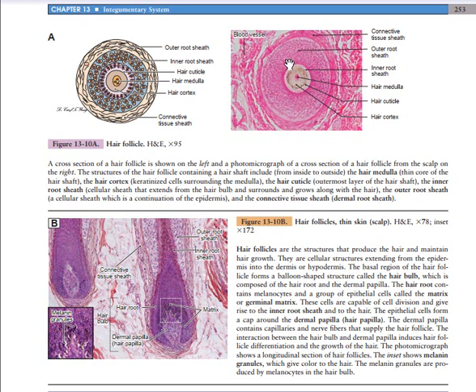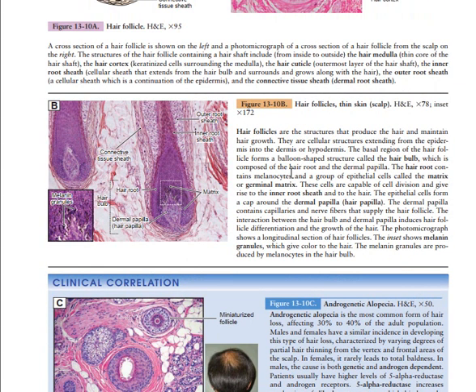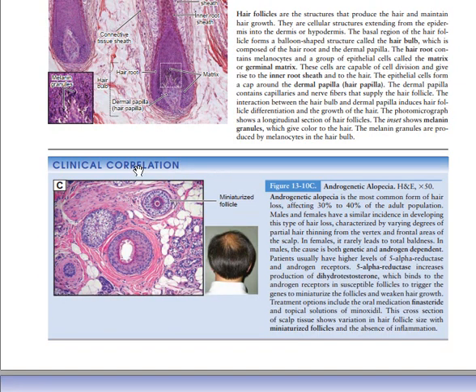Then outside, inside the skin, we have the inner root sheath, the outer root sheath, and the connective tissue. So this hair follicle is now in longitudinal section. On the longitudinal section, you can see an outer root sheath, an inner root sheath, the hair medulla, hair cortex, hair cuticle, then the connective tissue, and then the hair bulb at the end here. In the hair bulb, you have the hair root, the matrix, and the dermal papilla down there that you can see.